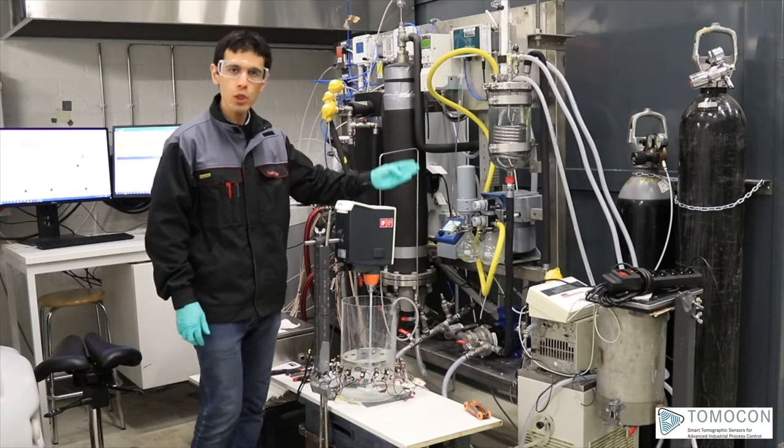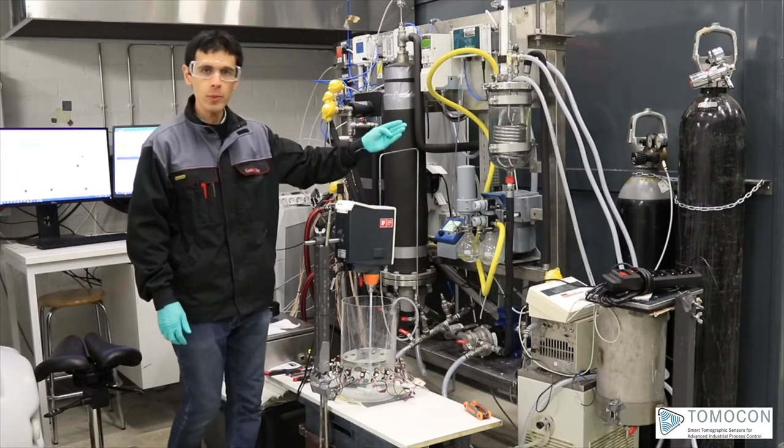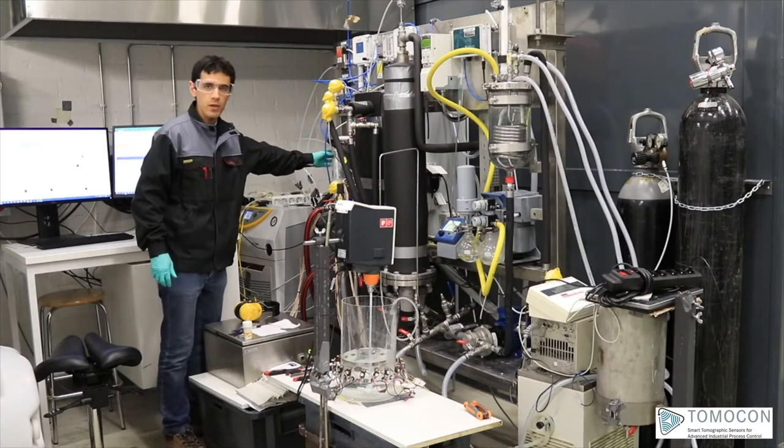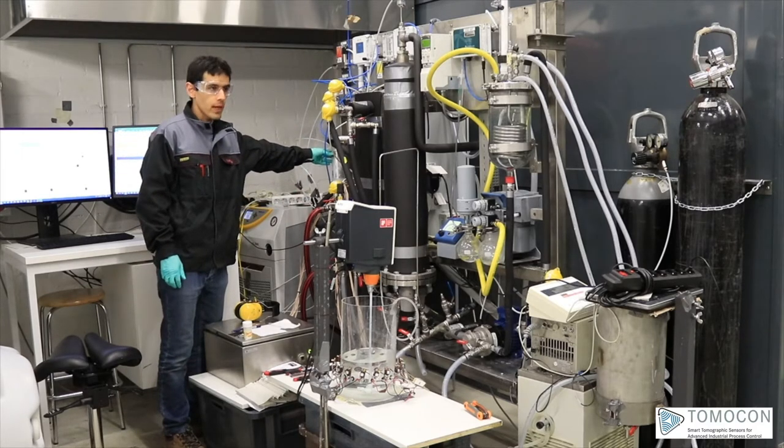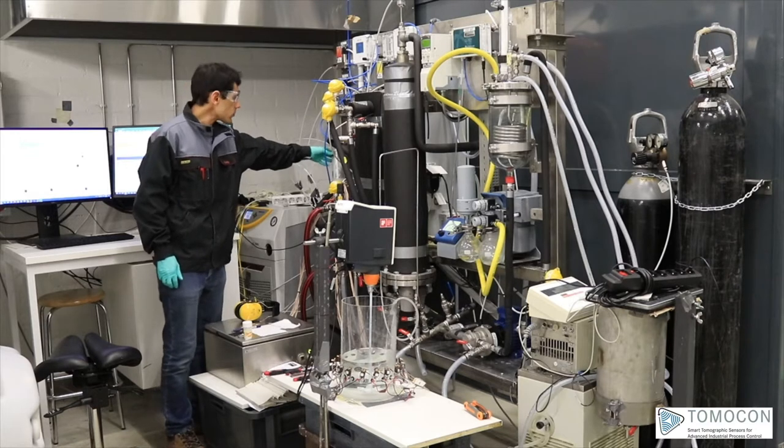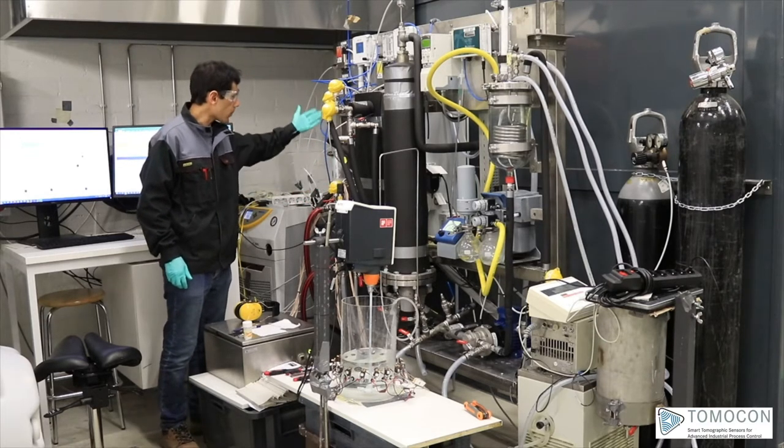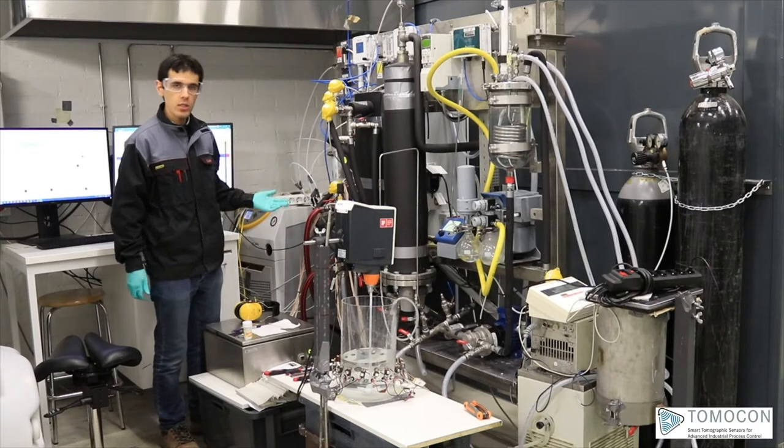There is a pump in there that circulates that absorbent solution into the unit. It goes like this part here where there is a hollow fiber membrane contact. And with pressure difference at the bottom and top, the liquid again circulates inside the solution.